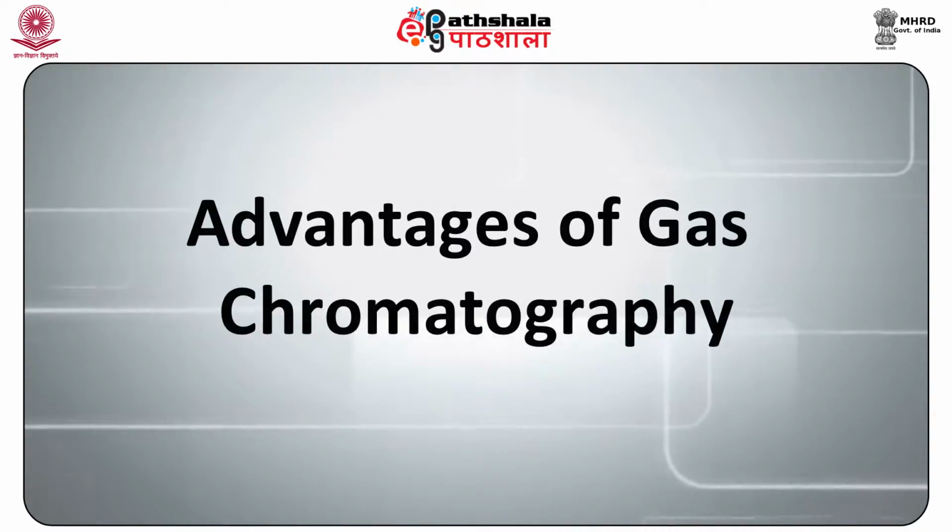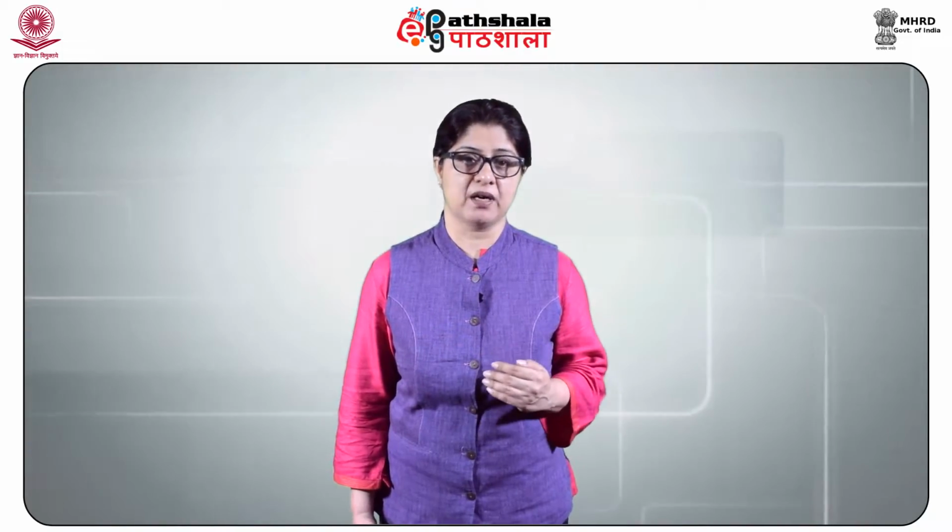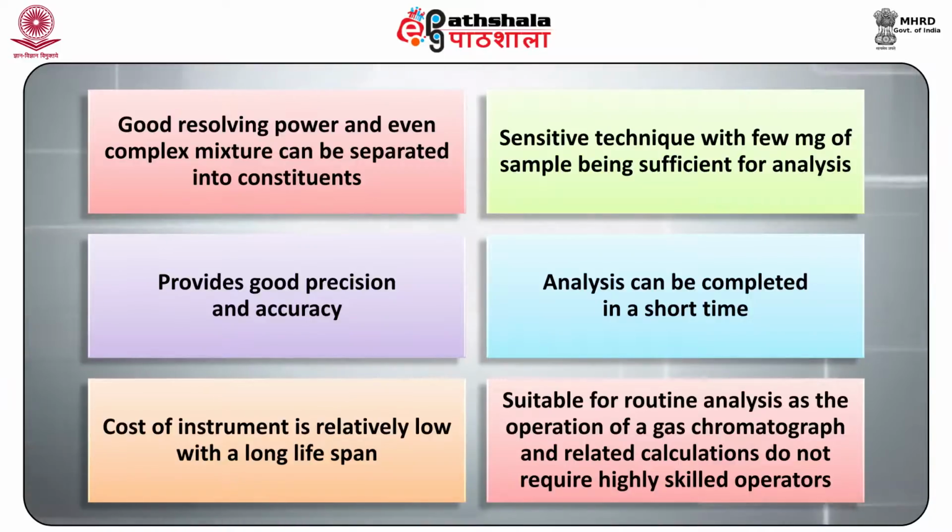Advantages of gas chromatography. The main advantages of gas chromatography are: the technique has good resolving power and even complex mixtures can be separated into constituents. It is a sensitive technique, with a few milligrams of sample being sufficient for analysis. It provides good precision and accuracy. The analysis can be completed in a very short span of time. The cost of the instrument is relatively low, with a long lifespan.